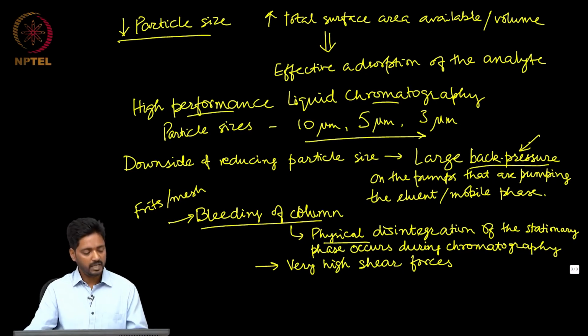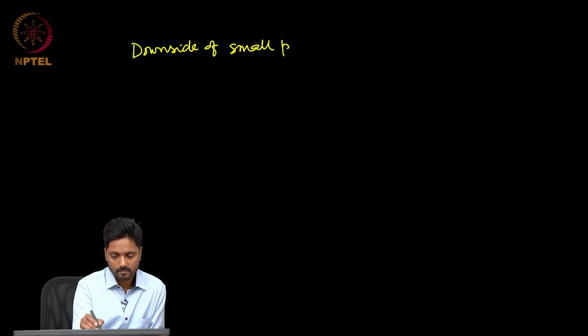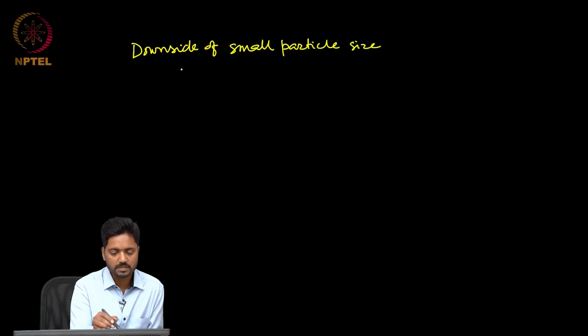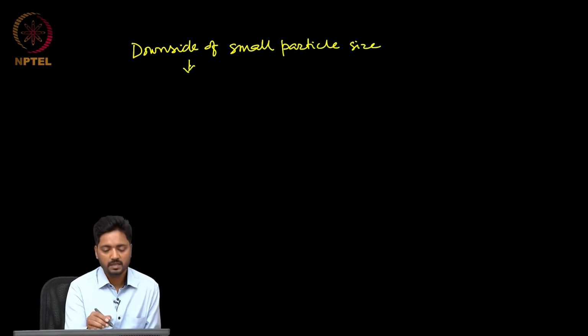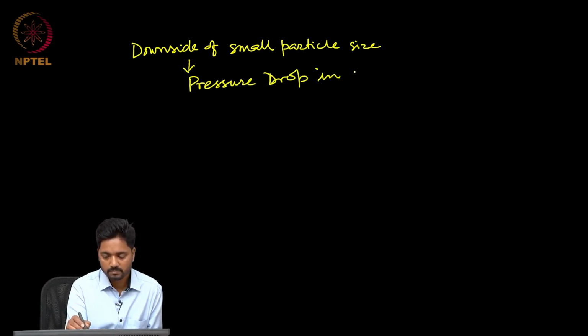Another very important downside of having small particle size is that we create what is known as the pressure drop in the column.